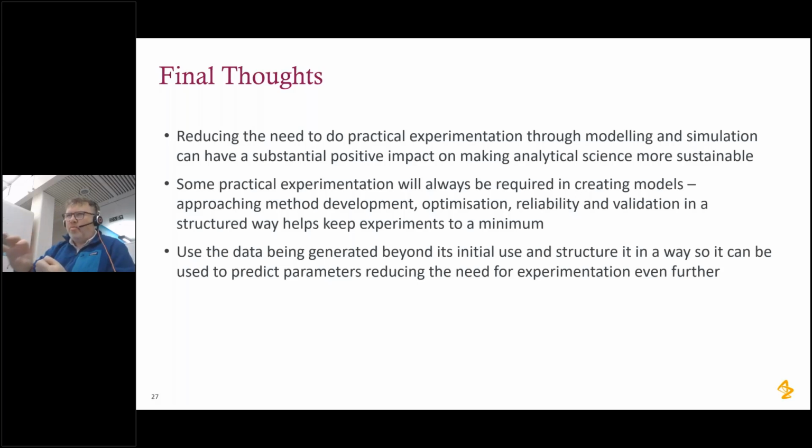And one of the final things is that once you've generated this data, it's really valuable. It shouldn't just be for this moment in time. You should think about where you can use this in the future. One of the things we look at now is how we can keep this model live and keep evolving it, so that if we do have to make changes to that method in the future, we've got a model that we can start with and use in the first instance to predict where other impurities that suddenly appear, as they do through development, may elute.